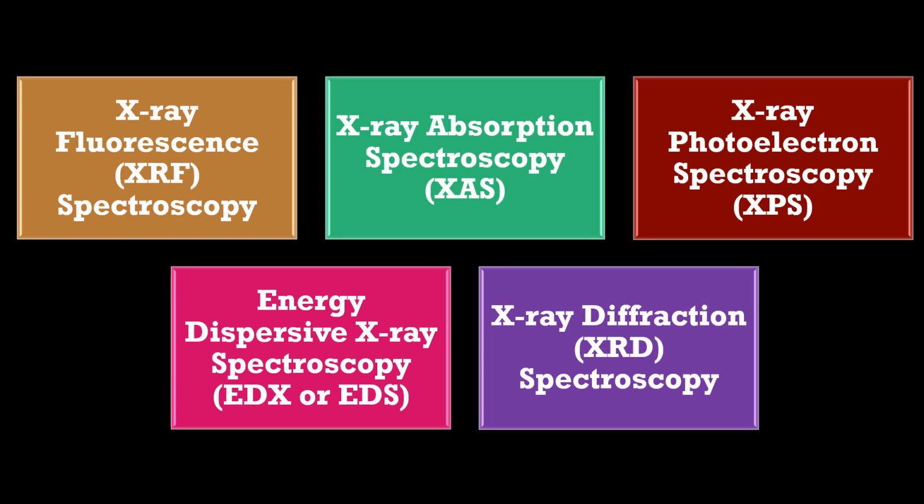They are X-ray fluorescence spectroscopy or XRF spectroscopy, X-ray absorption spectroscopy or XAS, X-ray photoelectron spectroscopy or XPS, energy dispersive X-ray spectroscopy or EDX or EDS, and finally X-ray diffraction spectroscopy or XRD spectroscopy.